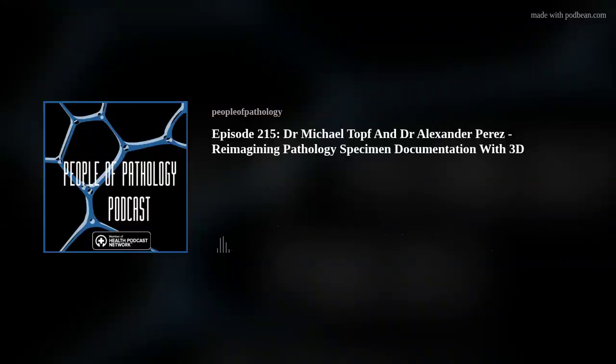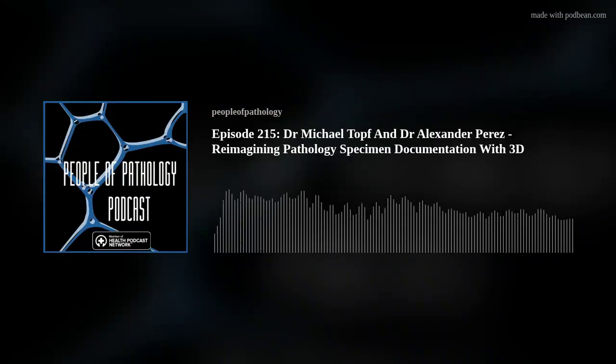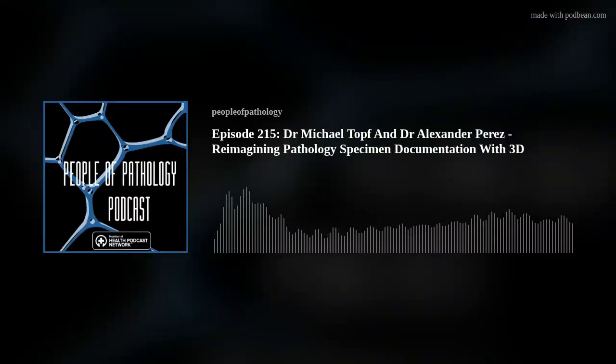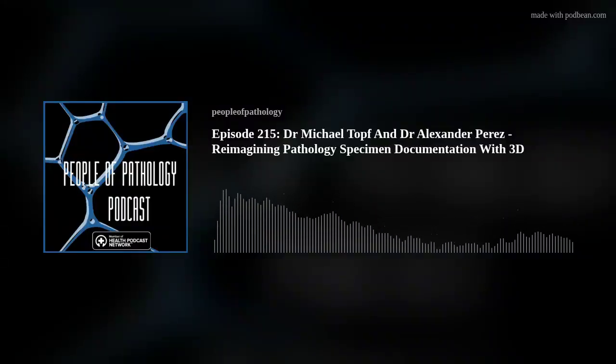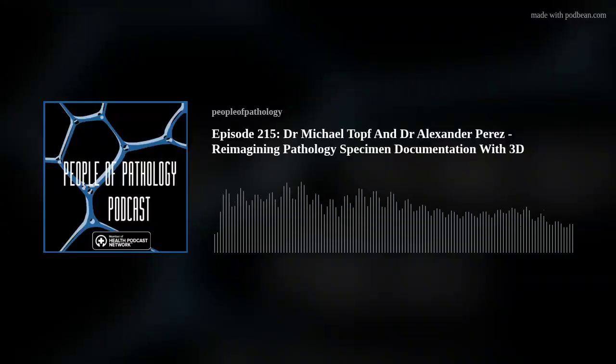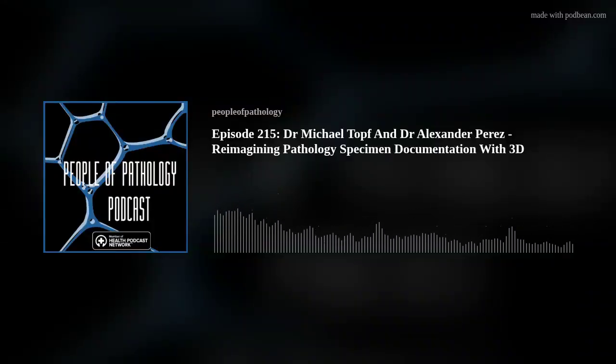Beyond the clinic and the classroom, there are also exciting possibilities in patient care. Imagine sitting down with a patient and showing them a 3D printed model of their tumor, helping them visualize exactly what was removed and why. Or picture an augmented or virtual reality environment where these scans are integrated directly into surgical planning. The opportunities are vast, and we're only at the beginning.